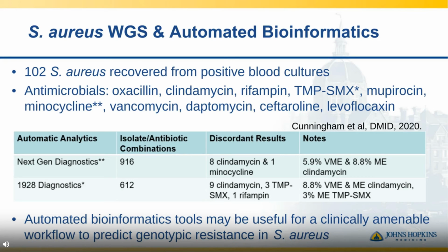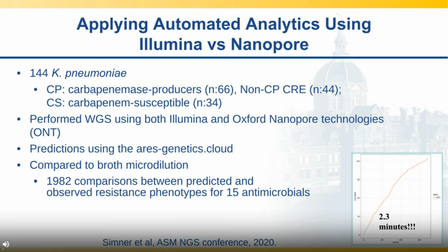Now these studies have been applying Illumina-based technologies, and what we wanted to do in our research lab is see, can these analytics handle nanopore-based data, because nanopore-based data can be produced, as we said, in real time, and has the potential to be available to impact patient care. However, what I find most of the time is that some of these programs are developed specifically for Illumina data and cannot be directly applied to nanopore data.